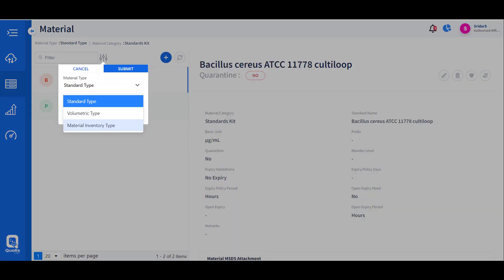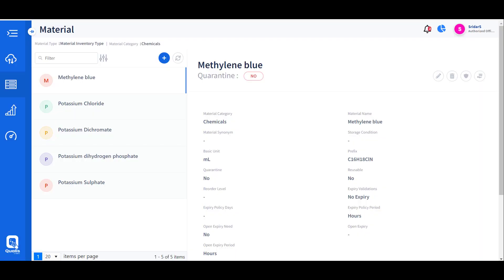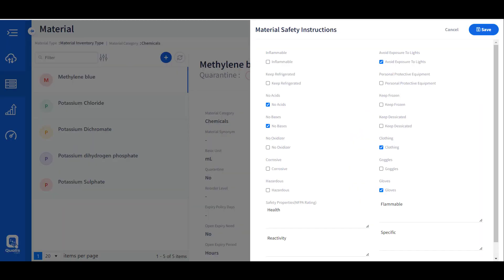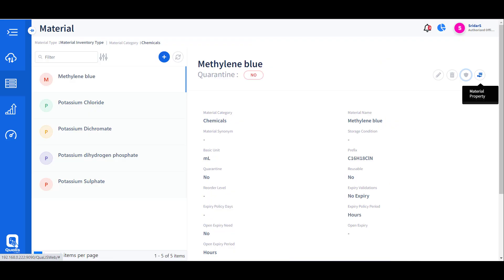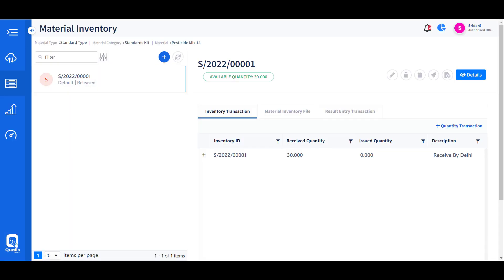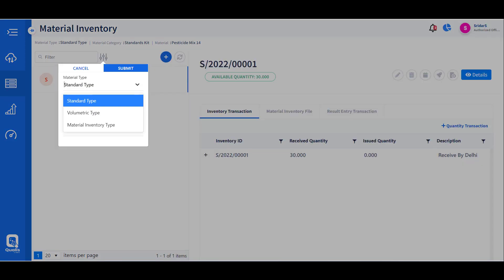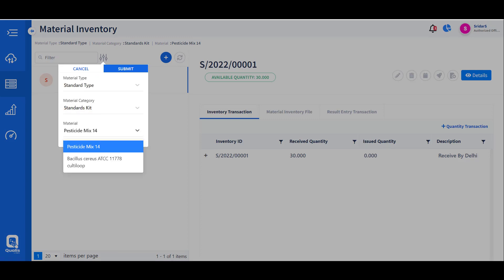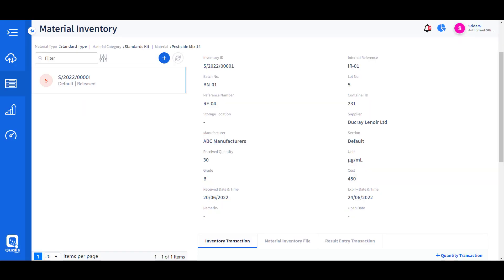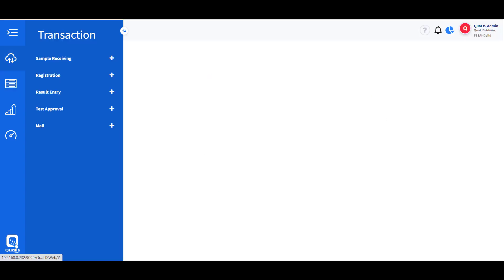Material management allows defining all materials, inventories, reagents, and standards along with quantities and expiry dates. Material safety data sheets and material properties can also be associated for reference and safety. Each inventory procured is added to the system with its properties and expiries, and as inventories are consumed, the balance is maintained. Reorder level alerts can be defined so that any inventory falling below the reorder level can be immediately procured.